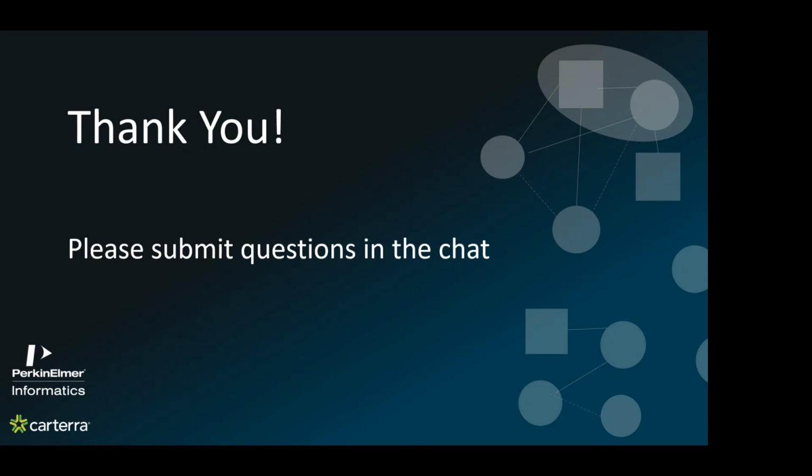We do know of several LSA users that have automated processes for those files. Once the run is completed, they are pulled up to network locations and can then proceed with more sophisticated analysis, like Christoph was demonstrating here, for example. So that's generally how data is collected on the LSA and then moves out of the LSA environment.